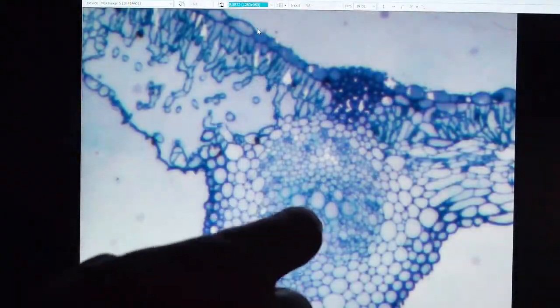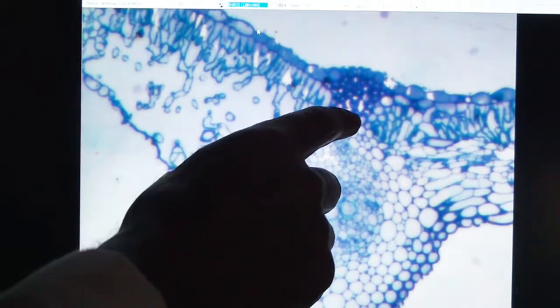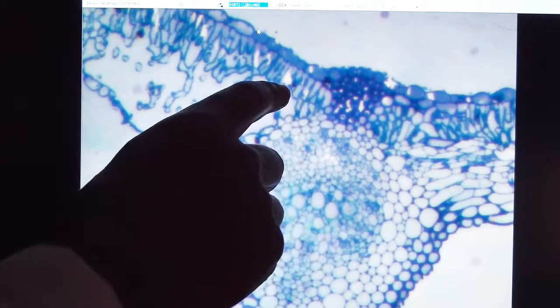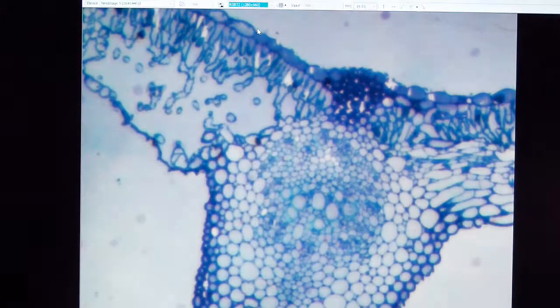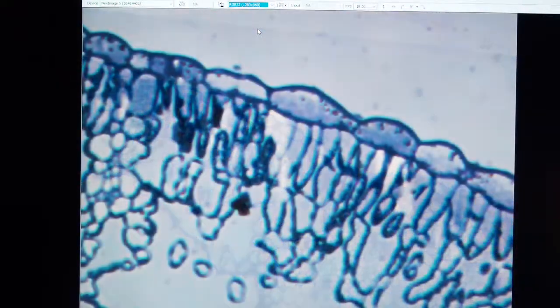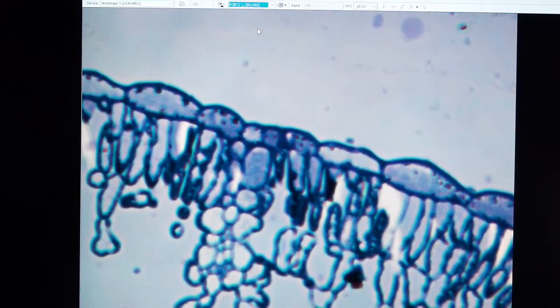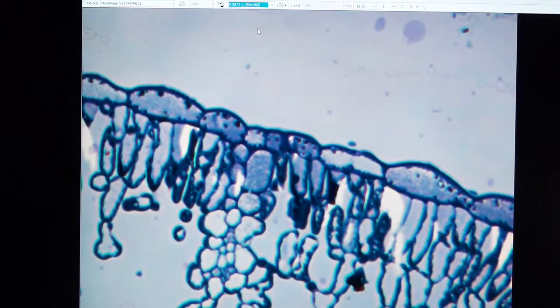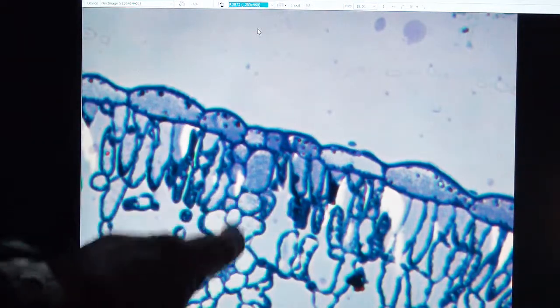The vascular bundle looks good here on the thick section. I can see some voids, some holes in the section where the infiltration didn't get quite perfect. But generally speaking, it looks pretty good. I've seen a lot worse. And again, some more voids. As I look at the upper epithelium and some of the palisade layer and such, the chloroplasts look good. The upper epithelium is pretty intact, a few little holes. But the whole section stays together and is not too bad.